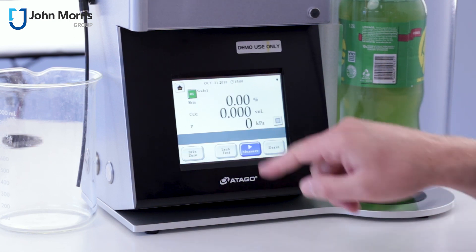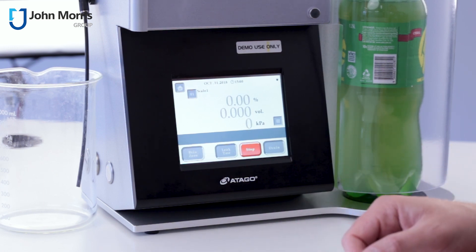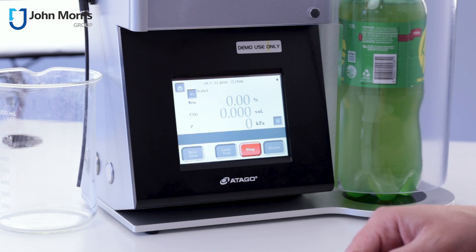Leak test complete. Let's do a measure. It's good up to about a 2-litre bottle and it needs about 100ml of sample to really take an accurate reading for you.